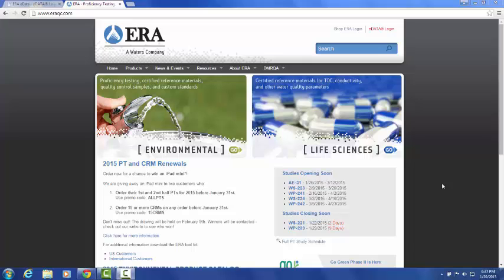The eDATA 2.0 site you'll see today is the result of a three-phase project to improve the speed and use of eDATA by optimizing the back-end technology and PT workflow, and to provide enhanced tools for QA managers. With that, let's take a sneak peek at eDATA 2.0.